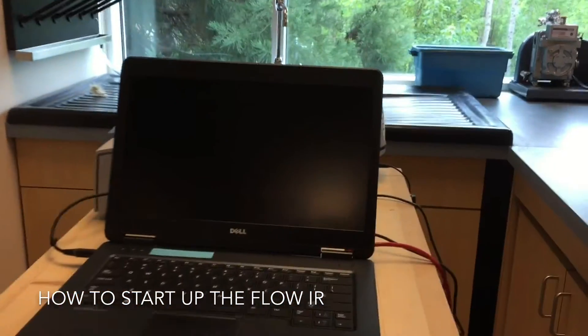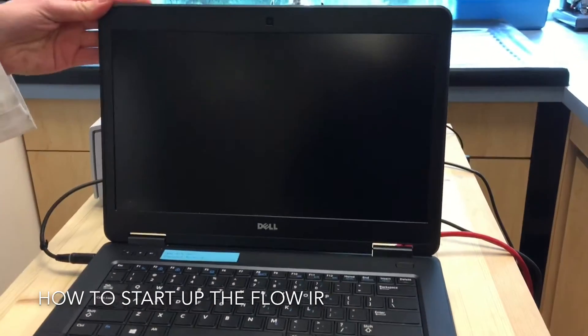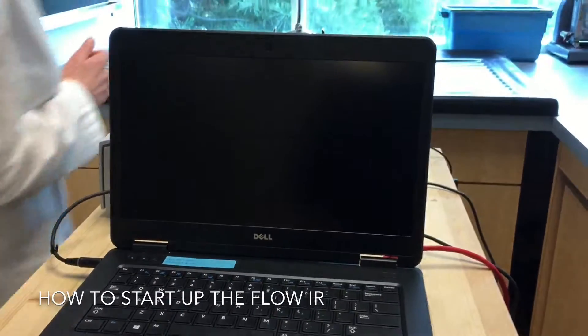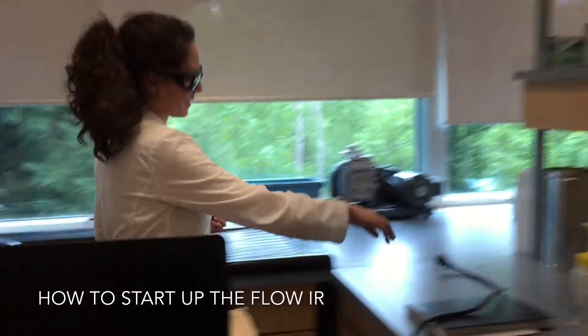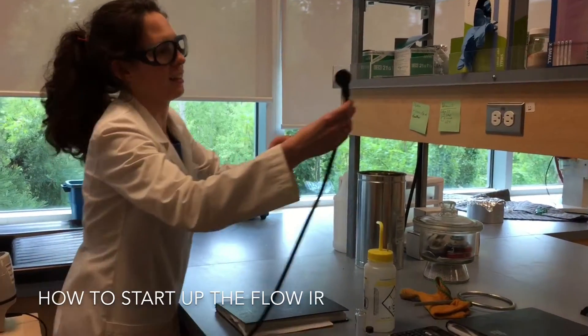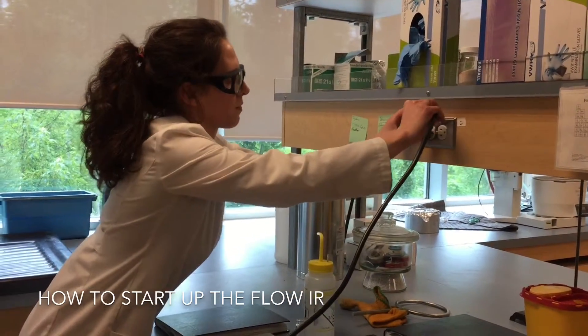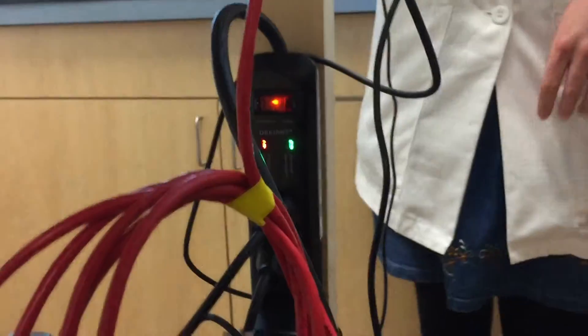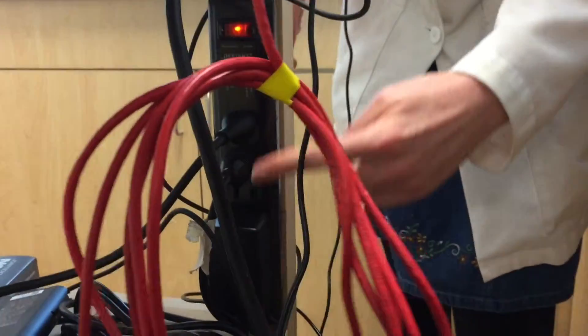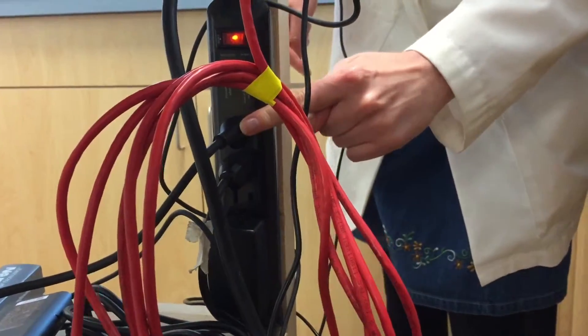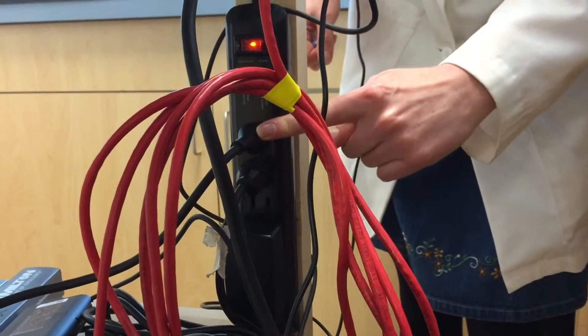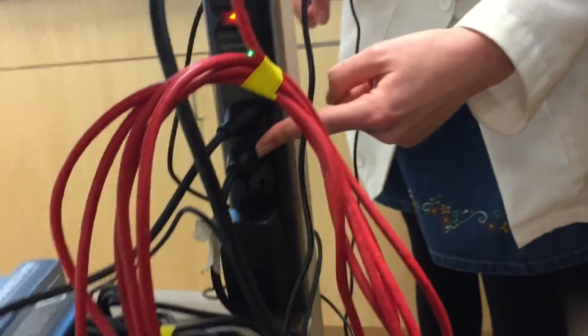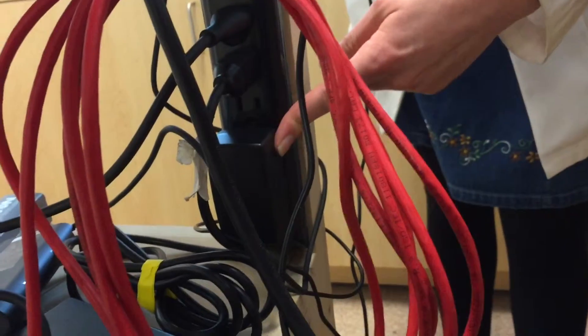So, first step is to make sure that the unit is plugged into the wall. Here's the plug-in. This is it turned on. This unit has the laptop charger, the IR power, and this is for the pump.